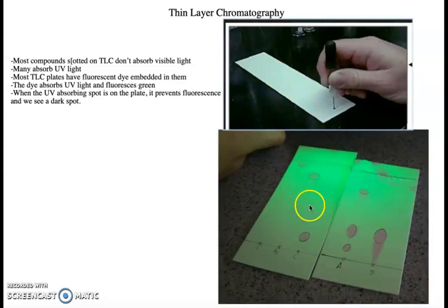And what you can see is that the TLC plate has a fluorescent dye attached to it that fluoresces green. What happens is when my UV absorbing spot sits on top of that fluorescent green dye, it absorbs the UV light. So I can't see any fluorescence there. So anywhere I have a spot, I see a dark spot from the lack of fluorescence. So this lane has one, two, three spots in it. This one has one really broad spot on it. The compounds are absorbing the UV light and blocking the fluorescence.